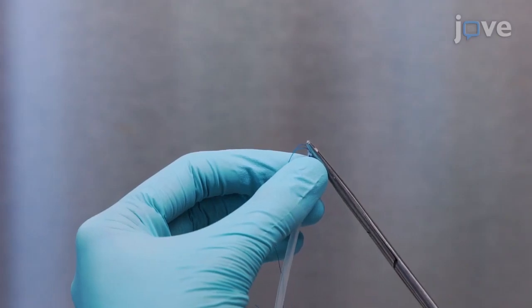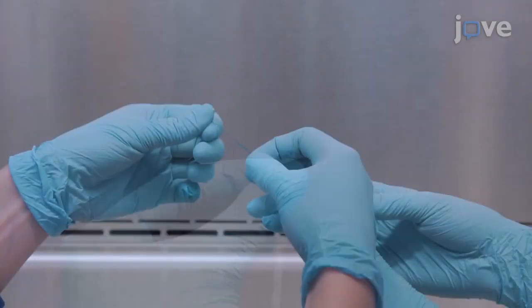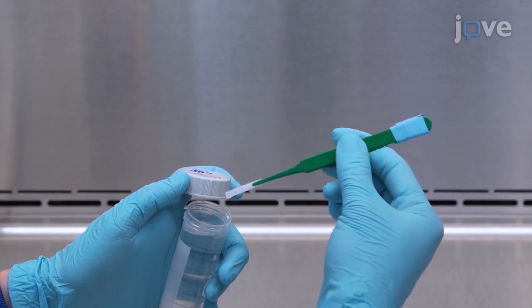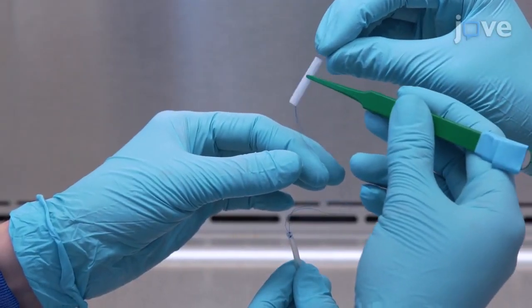After removing the suture needle, trim the edges of the silicone tubing into a triangular shape, and make a final knot at the end of the two 10-centimeter wires. Dip the electrospun scaffold in 30% ethanol, and place the scaffold over one end of free suture wire.